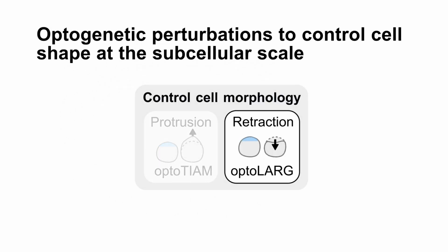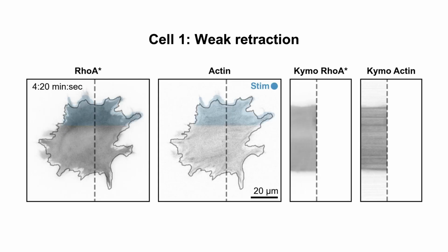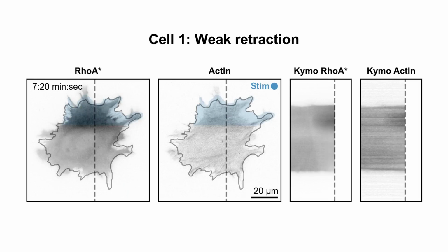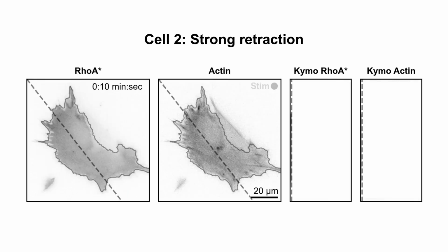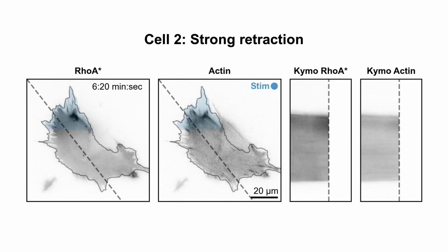Switching to optogenetic RhoA, the illuminated edge accumulates active RhoA and effectin, then snaps inward. By automating these experiments, FARO lets us probe and perturb cytoskeletal responses locally, reproducibly, and at statistically relevant numbers.